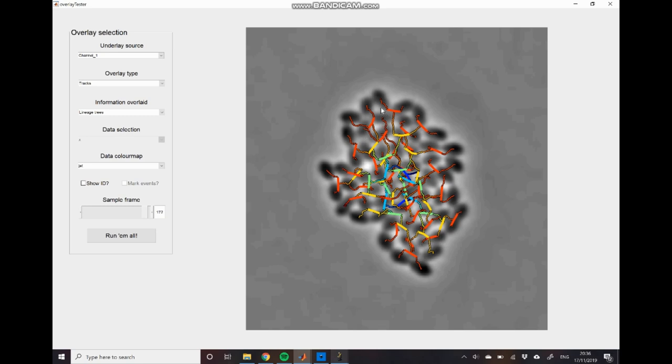And you can see that these thick lines represent the divisions that have been detected. And so you have this mother cell coming in and then these two daughter cells coming out of each of these division events. And so this all looks good.